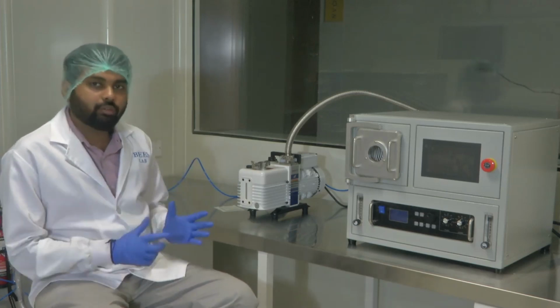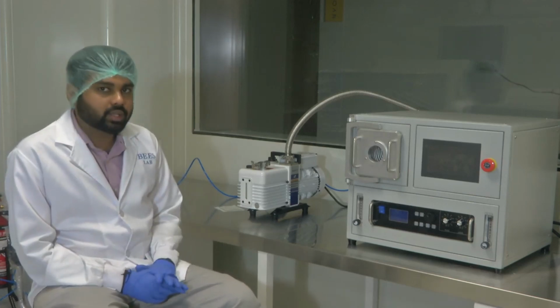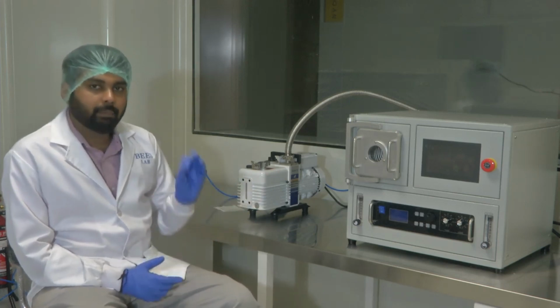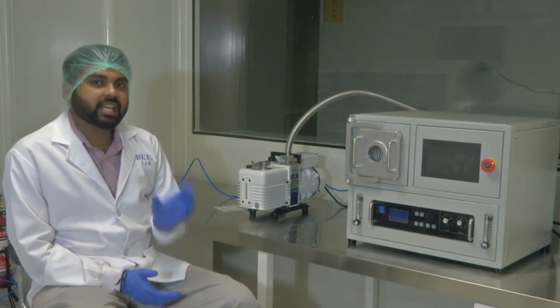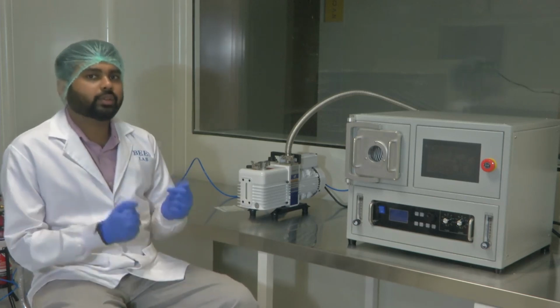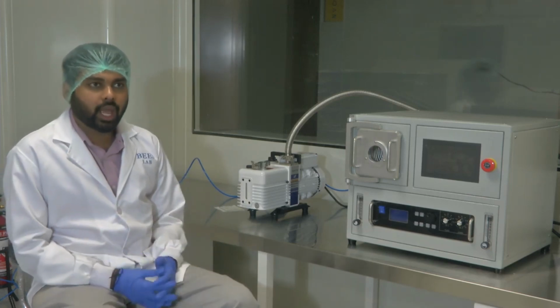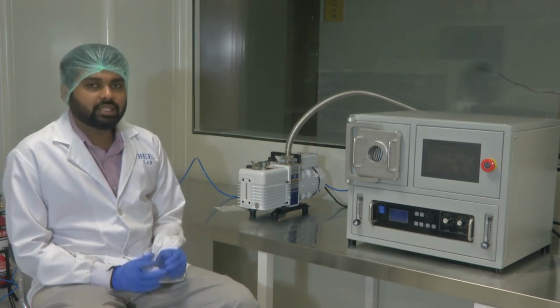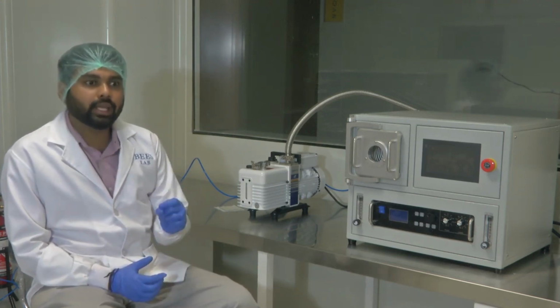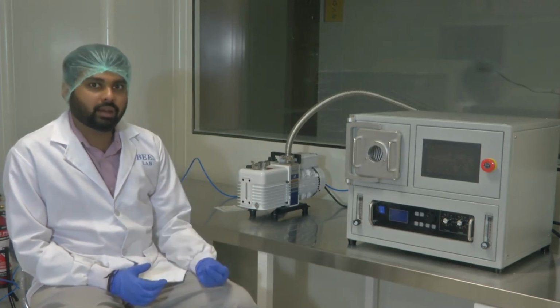Now coming to the workflow of how we test this system. I told you that this is an oxygen plasma system and we have a chamber. I will show you all the things later. Plasma will be created in a chamber which has a definite volume. When you open a chamber, it will be filled with normal air, which has nitrogen, oxygen, argon, everything. It is very difficult to control plasma and control the extent of etching or cleaning that it does if you try to create plasma from normal air.